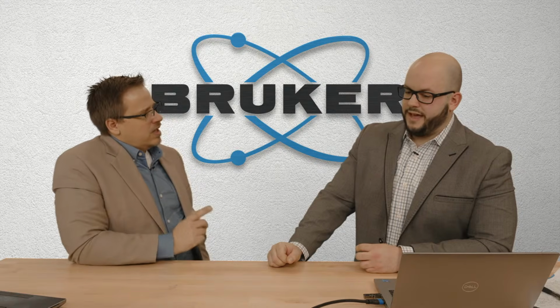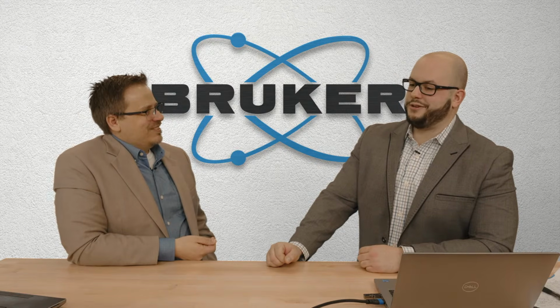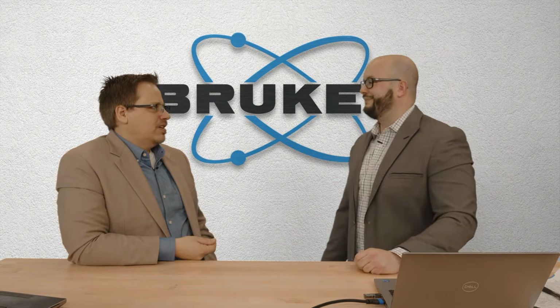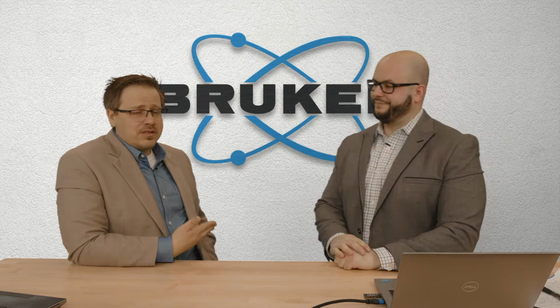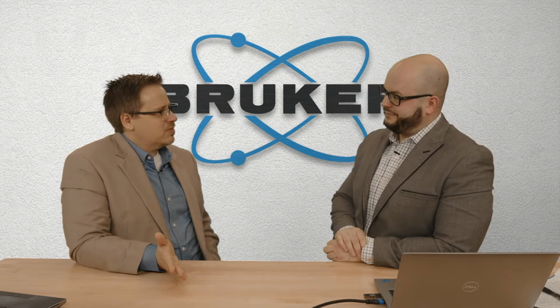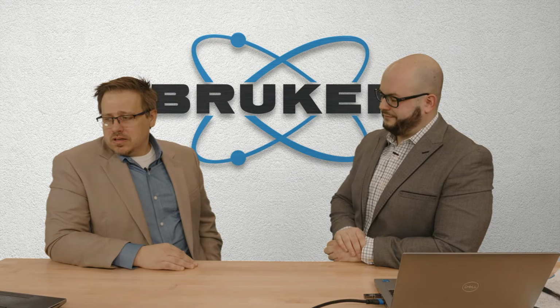And now, what if you have epitaxial films? Epi films, oh, those are great. There you're just looking at relative peak positions between the substrate and the film. Less about stress, more about strain. Strain engineering is huge for epi films. What we do there is just measure the lattice parameters, and you'll be good to go.